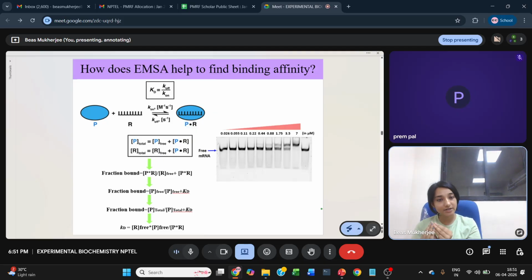The nucleic acid is labeled. It can be 5' FAM labeled, or any other chemical group that is fluorescently labeled or radioactively labeled. If it is radioactively labeled, it is more sensitive. If it is fluorescently labeled, there is less chance of you dying. So now people are going more and more for fluorescent labeling, although it is less sensitive, because this is safer for the researcher.